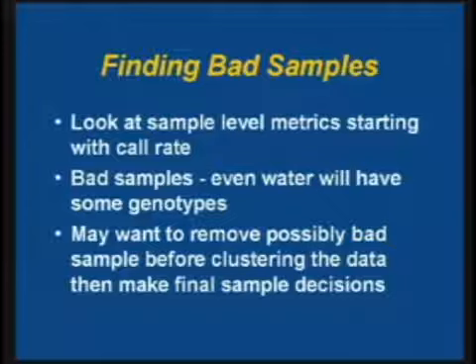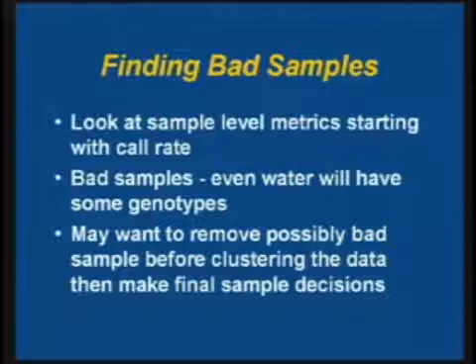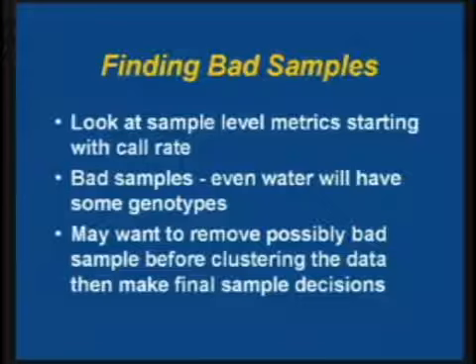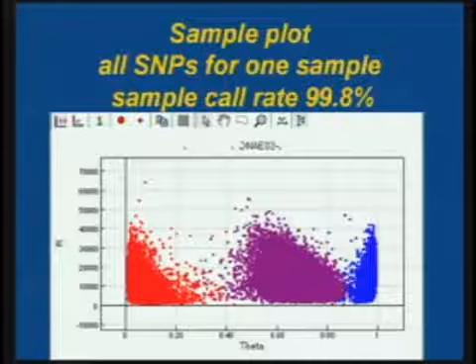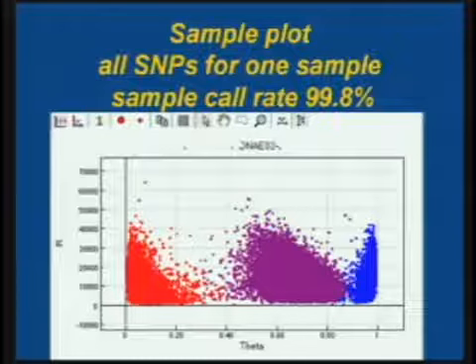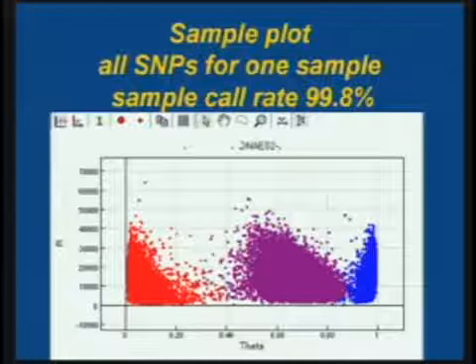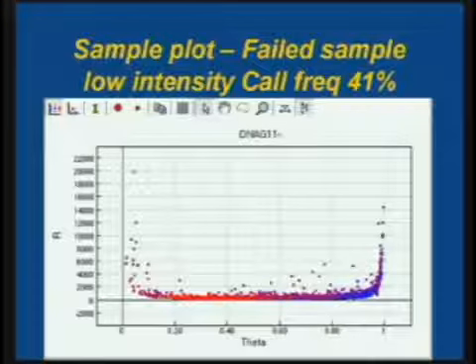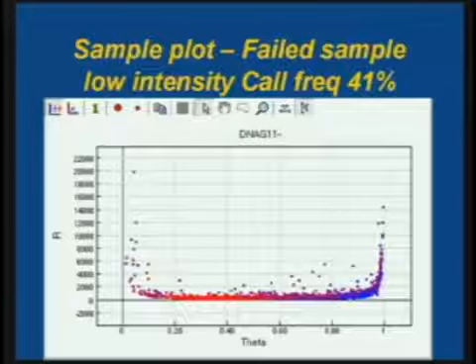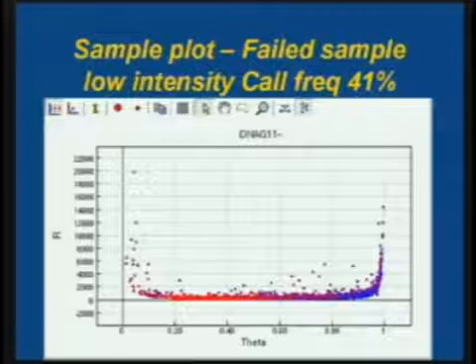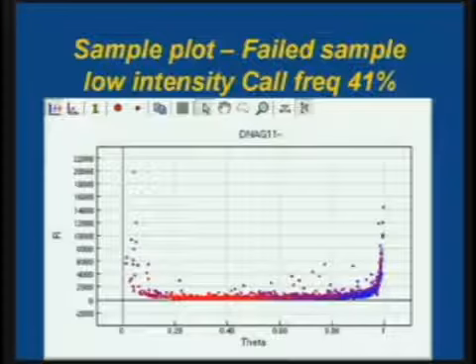Finding bad samples: you want to do the same kind of thing — look at sample-level metrics, starting with call rate. Bad samples have genotypes; even water has genotypes. You may want to remove some of the bad samples before clustering, because they can draw the clusters in odd directions. This is another way of looking at the data — Illumina calls it a sample plot. It shows all SNPs across the array for one sample: here are the homozygotes, the heterozygotes, and the other group of homozygotes. You want to see at least some semblance of three clusters. This is a sample that failed utterly — there's almost no intensity and no clustering. It had a call frequency of 41 percent. You don't want to be analyzing those genotypes — they're just meaningless.